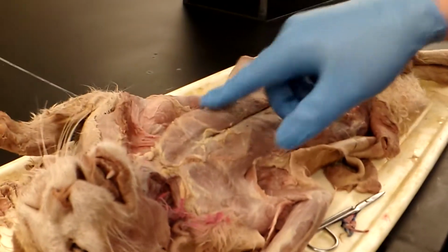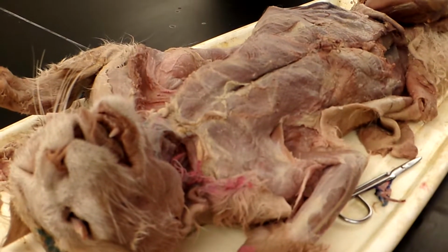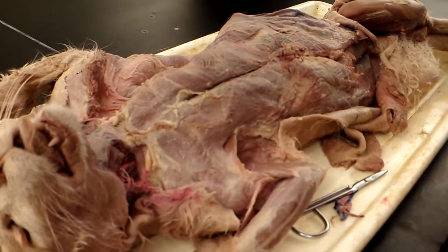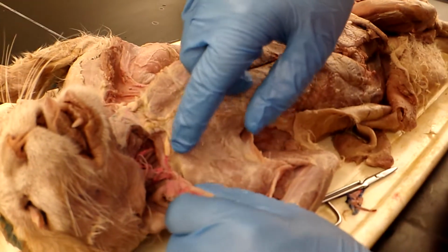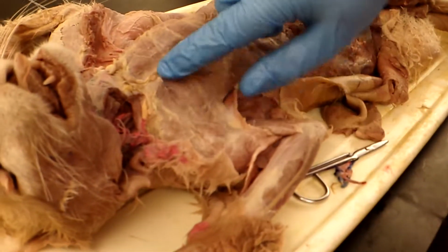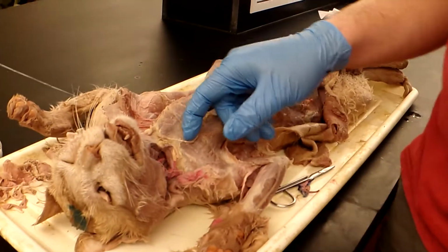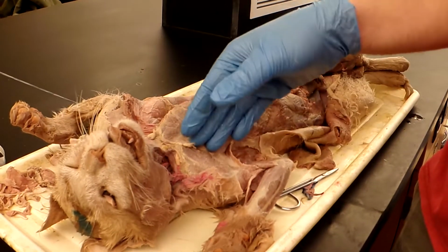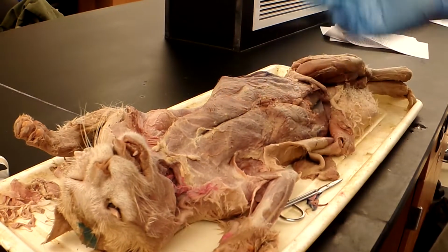Okay, this is the cat musculature, starting with the superficial thoracic musculature. There is the pectoantebrachialis, which is located right up here by the shoulder. Goes up by the shoulder. And the origin is the manubrium. Insertion is the forearm, and the function is that it adducts the arm.